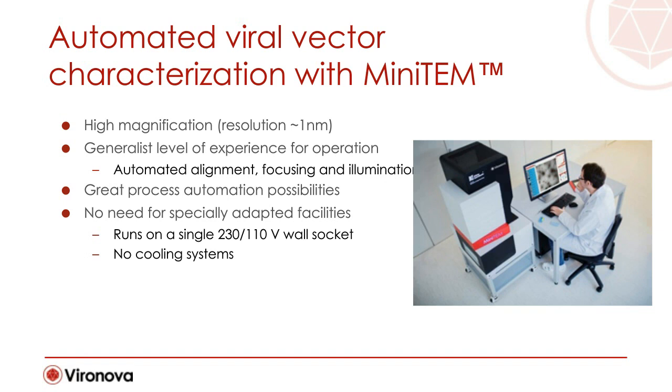Thank you, Joanna, and thank you, Josefina, for the colorful introduction and for explaining the setting in which electron microscopy can provide insights in biopharmaceutical development and production. Now we're going to talk about the MiniTEM and the use of this system to answer some of the questions we have discussed previously. But first, the basics.